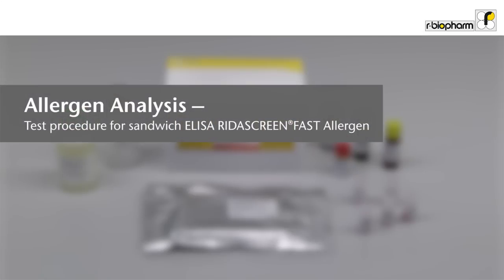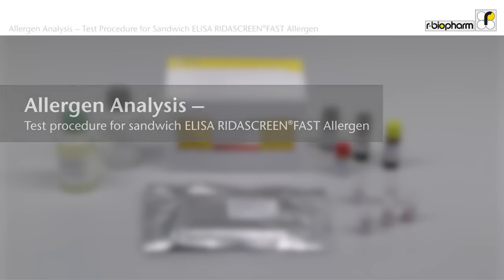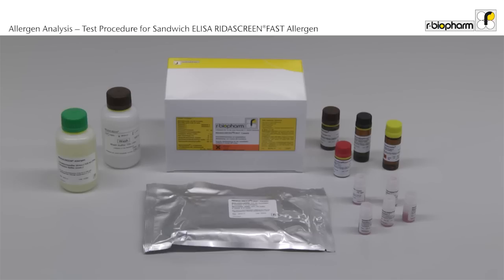Allergen Analysis: Test procedure for the Sandwich ELISA RIDA Screen Fast. The test procedure is very similar for all RIDA Screen Fast Allergen tests. Key parameters: incubation time 3 times 10 minutes, 5 standards, pipetting volumes of 100 µL, 2 washing steps including 3 wash cycles, and the washing buffer is a cross product component. The video shows the RIDA Screen Fast casein test as an example.